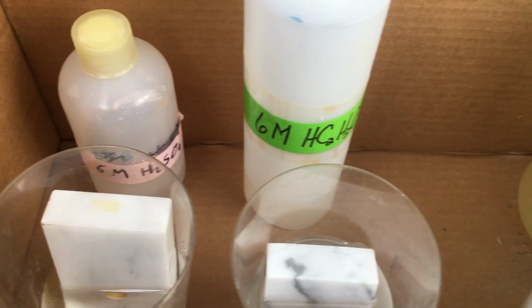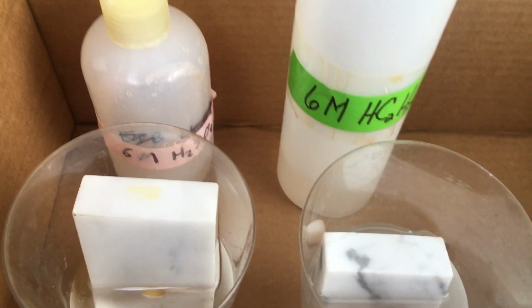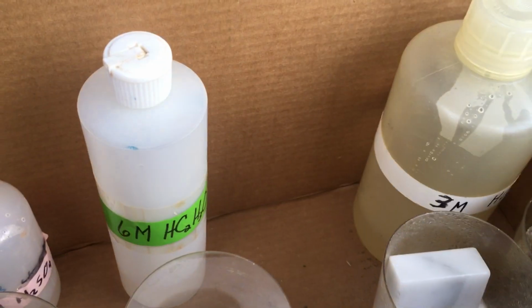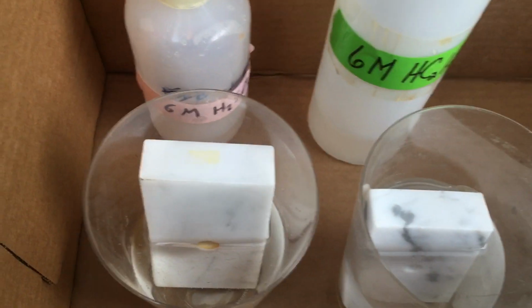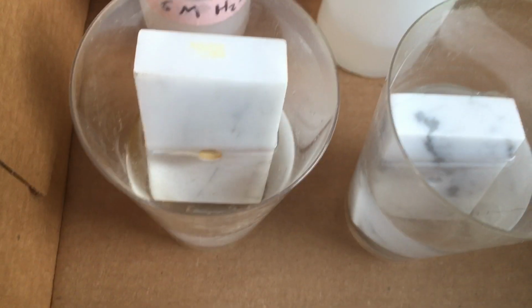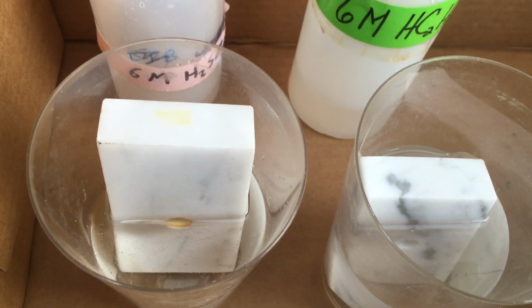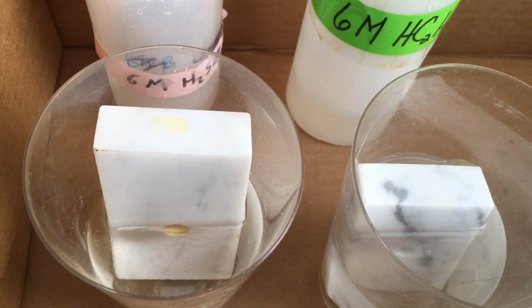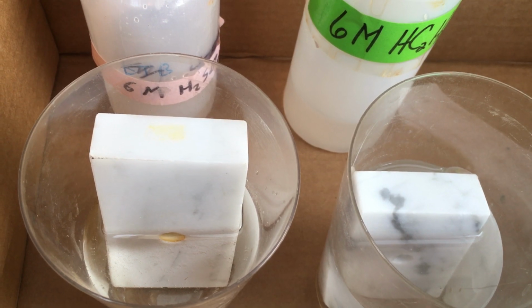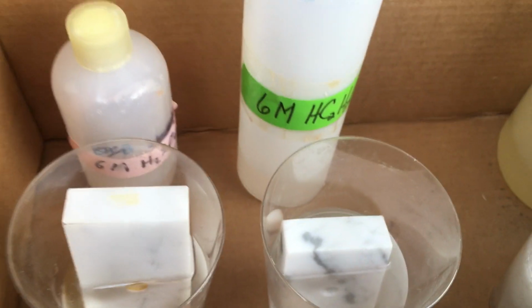So let's move on to the sulfuric acid. Sulfuric acid is a well-known strong acid, and it's a 6 molar concentration, so it's twice that of the hydrochloric acid. But if we look in here, again, it doesn't look like there's a whole lot happening. There are a few bubbles I can see on the surface of the marble, but it's remarkably, and to me surprisingly, unreactive.